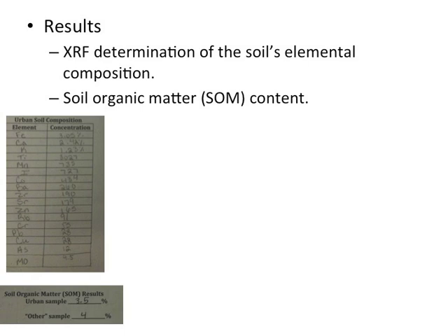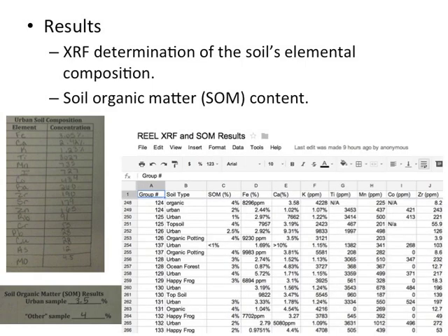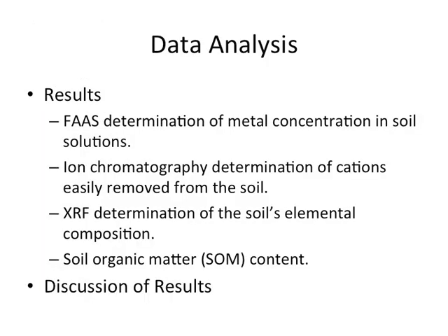On the datasheet, you will also report your XRF results and the soil organic matter results. You are asked to report these values in another Google document file. The first step in data analysis is to compile your results. With this information, you are now ready to move on to the discussion.